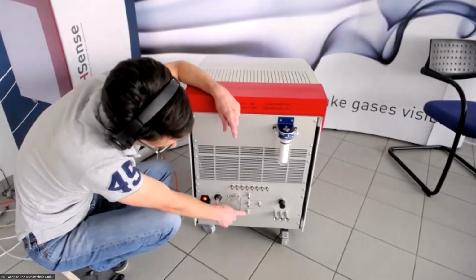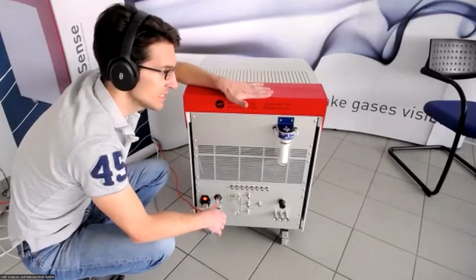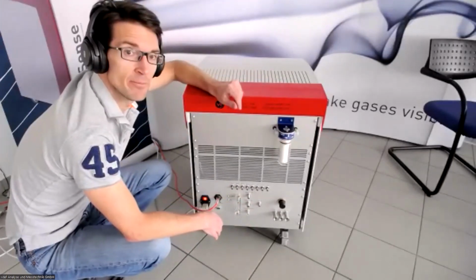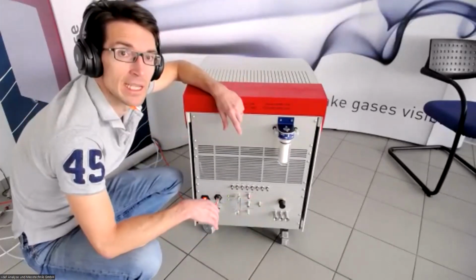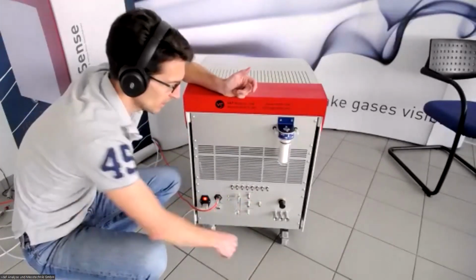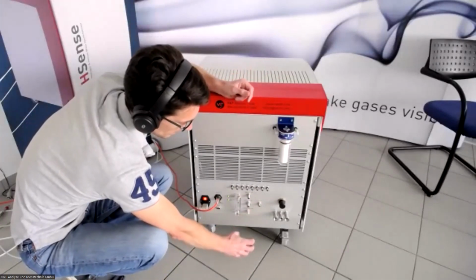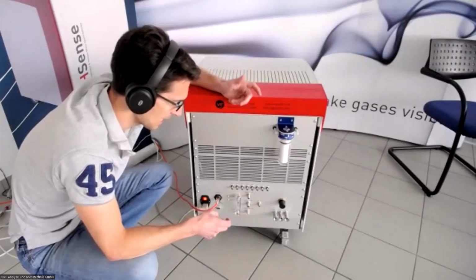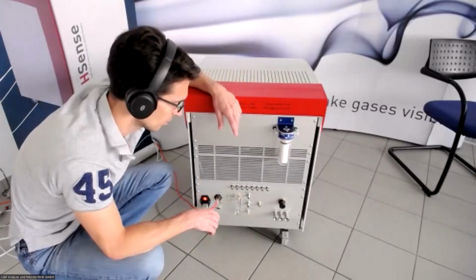And the last one down here, since we have already seen that we have a gas cooling device integrated into the instrument, is a liquid out port where the condensed liquid from the sample gas will be provided, and basically you would just connect a small hose there and a small glass or something where the liquid can be drained, so it doesn't fall on the floor.